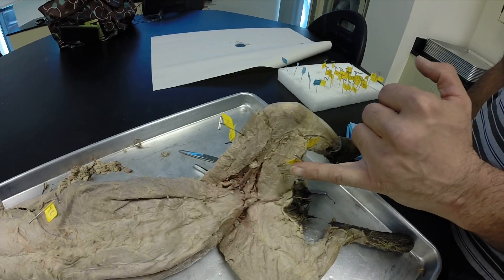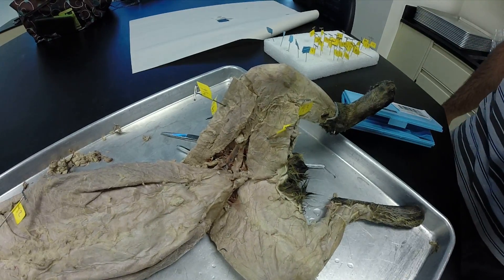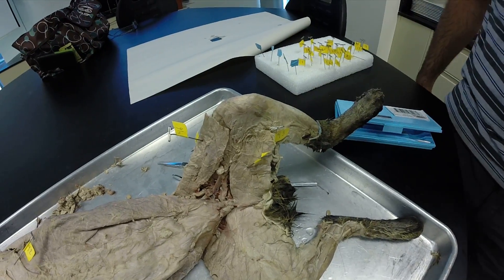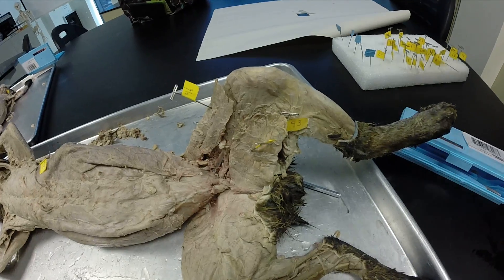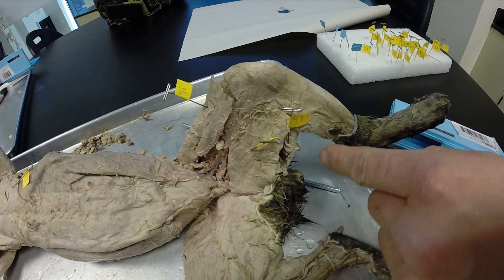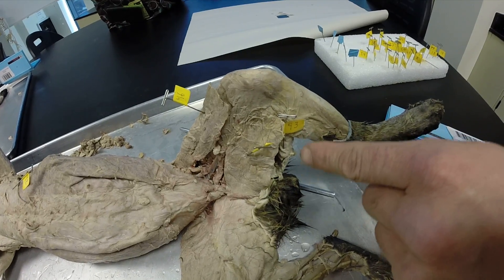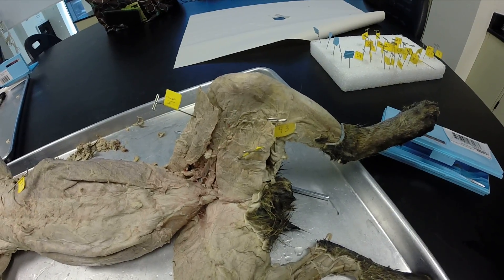What about right here? This one's our gracilis. What about this one? That one's tough to see because it's kind of covered up, but it's the very bottom one in this series of leg muscles. That's our semitendinosus.